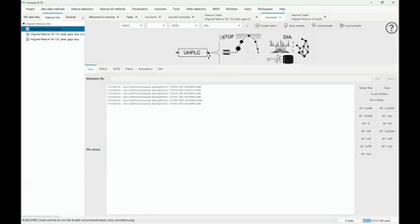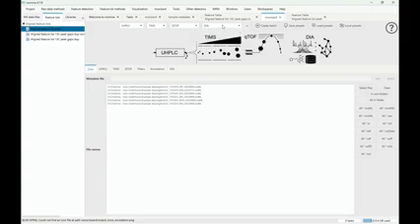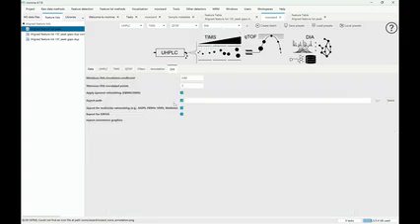There was basically a small bug where you could just not select the feature list in the manual data analysis. You just go in the wizard. There's the DIA, UHPLC, or whatever workflow you do, and then DIA. Or let's say you do the timsTOF and DIA. Then, of course, there are a couple of parameters for the deconvolution of MS2 spectra into pseudo MS2 spectra, and that's going to give you the results. That's going to give you MS2 scans for spectral library matching, networking, and all these kinds of things. Just try it out, and there are also some videos online on this. Thank you. Give us feedback.